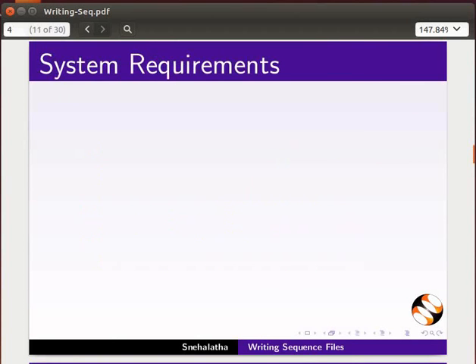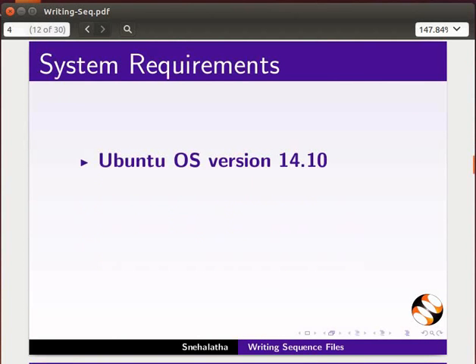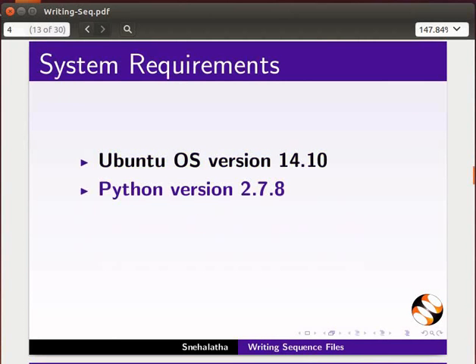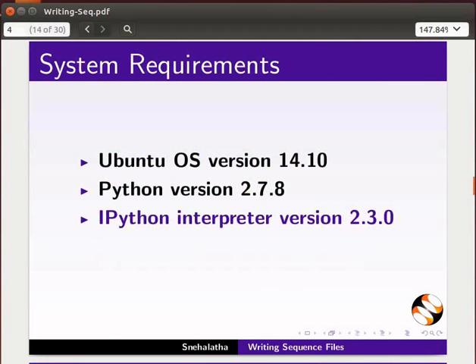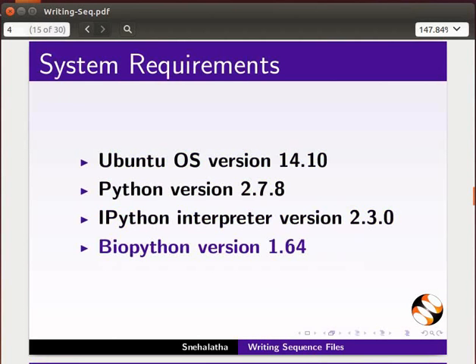To record this tutorial, I am using Ubuntu Operating System version 14.10, Python version 2.7.8, IPython Interpreter version 2.3.0, and BioPython version 1.64.